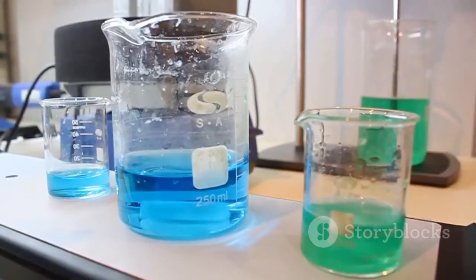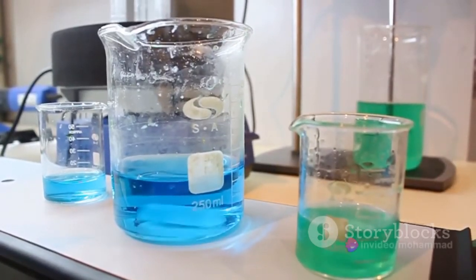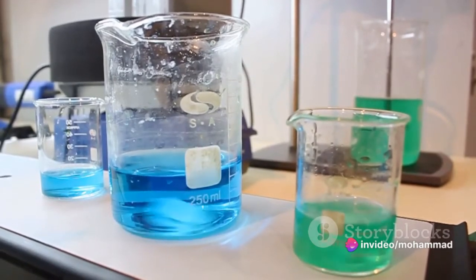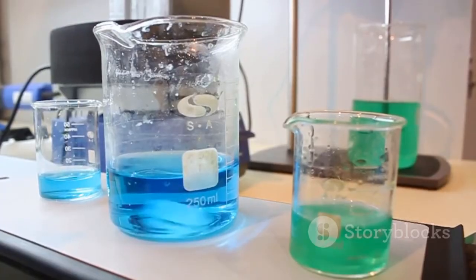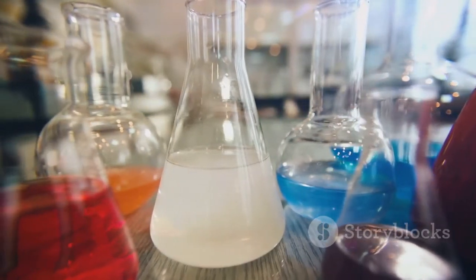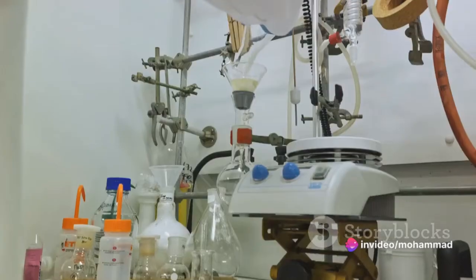However, gas chromatography is not without its limitations. One major drawback is its inability to handle large, non-volatile or thermally unstable samples. Essentially, if a compound can't be vaporized without decomposing, or if it's too large to travel through the GC column, then it's a no-go for GC. This limits the range of compounds that can be analyzed.